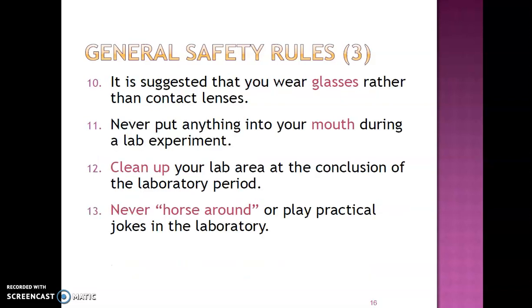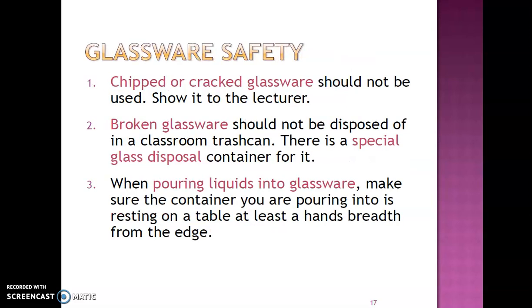It is suggested that you wear glasses rather than contact lenses. Never put anything into your mouth during a lab experiment. Clean up your lab area at the conclusion of the laboratory period. Never horse around or play practical jokes in the laboratory.